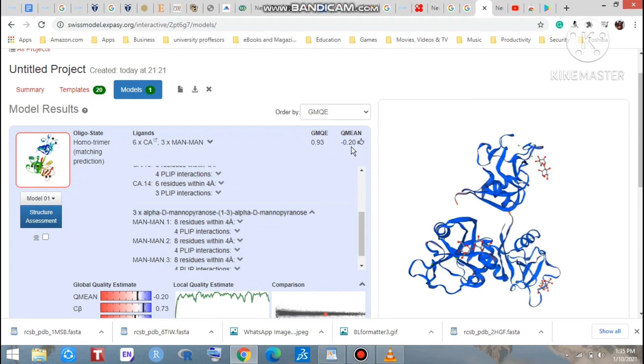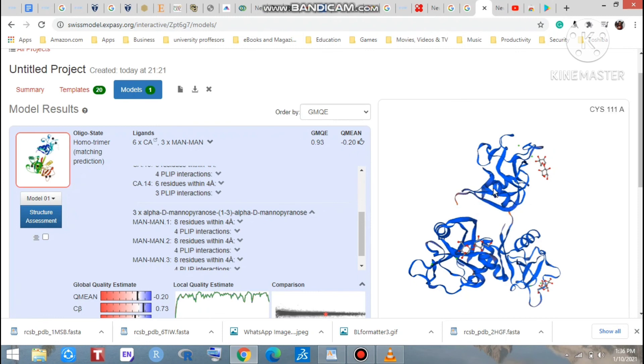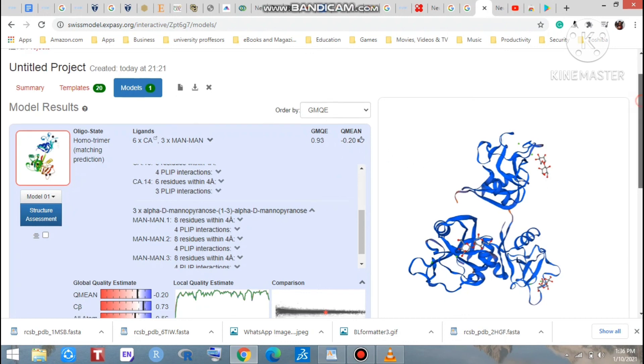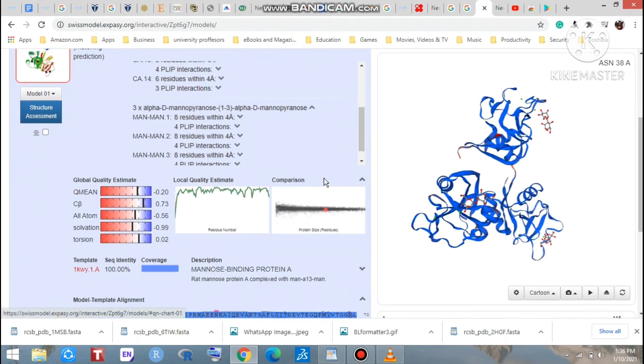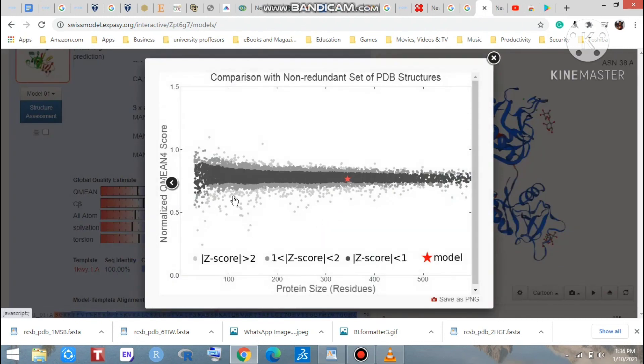What is this QMEAN score? Actually, you have built a model - is it good or low quality? How good is the model? It depends on this QMEAN score. If you get this like a thumbs up, that means you built a model which is good enough.